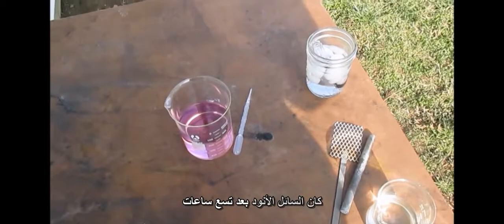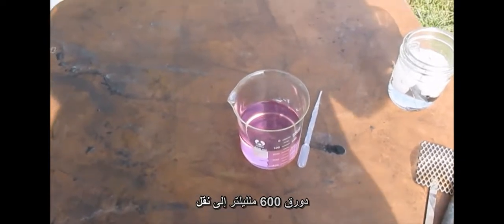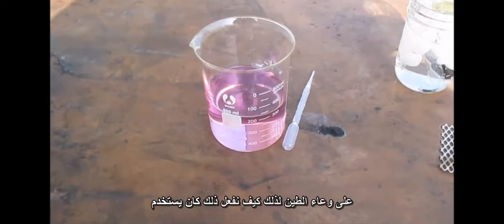Here we are 9 hours later. The anode liquid was transferred into a 600 milliliter beaker. As you can see, it's a little pink because I think it reacted with some of the impurities in my rubber stopper I was using on the clay pot.